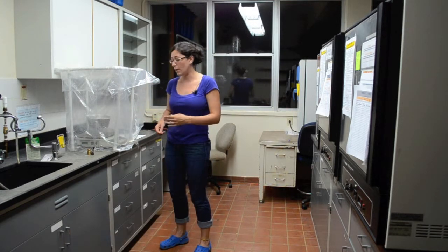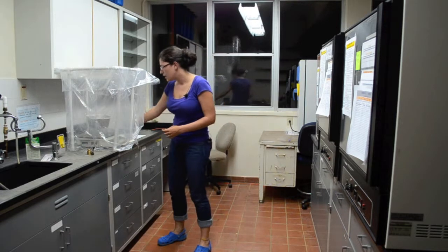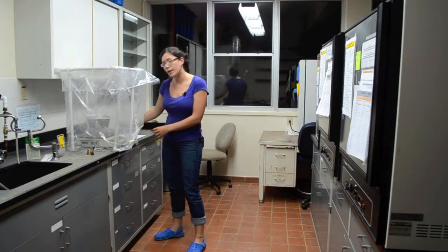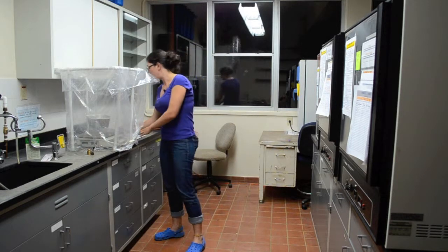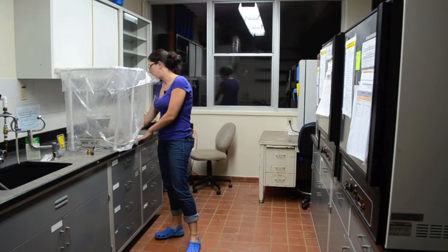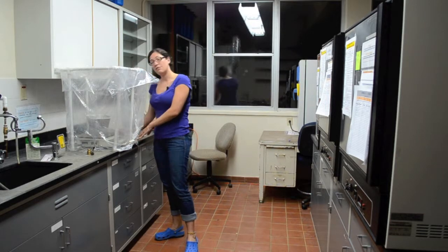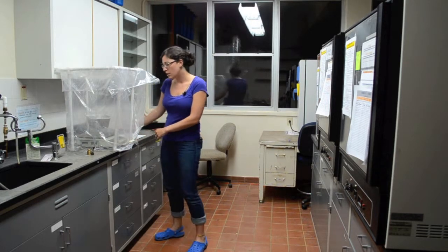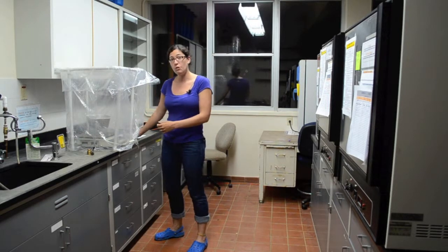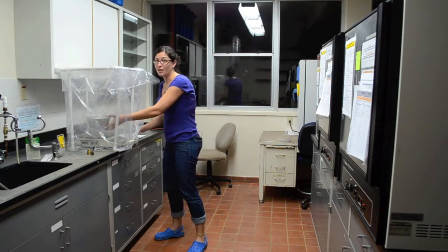This sample weighs 74.8 grams, and I can see that yesterday it weighed 74.9 grams. That means it has lost a little bit of weight, so it's going to need to go back in the oven and dry for a little while longer.